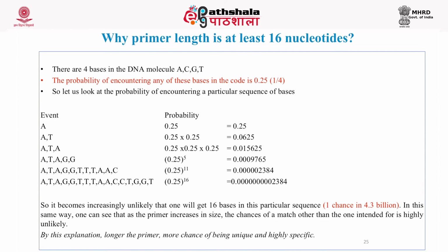If the primer is too long, the annealing temperature will be too high. The chances of self-complementarity will be higher and secondary structure formation will be higher. All these conditions will lead to failure of PCR. Hence, the primer length is usually recommended to be 18 to 24 nucleotides long for human DNA sequences.